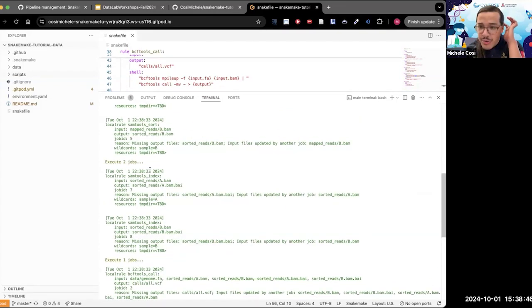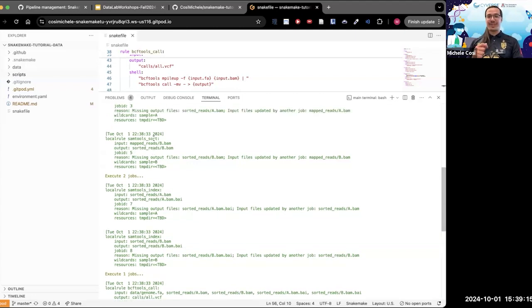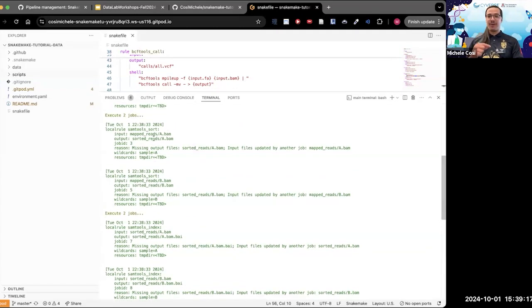Do you know the hotkey to run a line of code in Gitpod? I'm not sure if I follow, Cora. Enter. So you type in your code and then you press enter and it should run. Is that what you're asking? No, but never mind. All right. Do let me know or send me a private message if you want to tell me more about that.